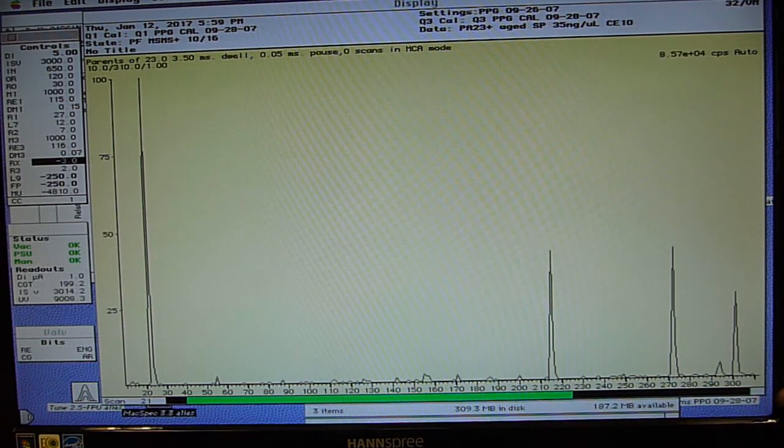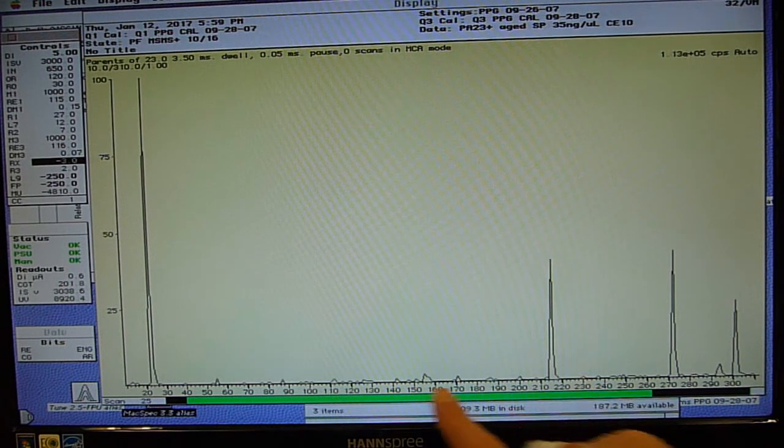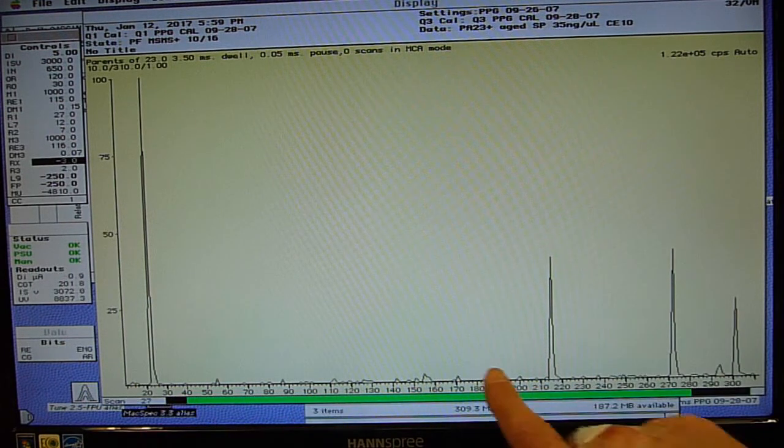Because actually when we have, this is off. One could say, this is noise. These little guys here.